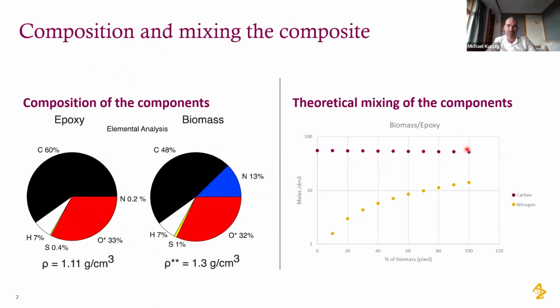If you had a lot of cell material and you tried to normalize against carbon, you could affect the relative amount based on normalization instead of the location of the actual drug.